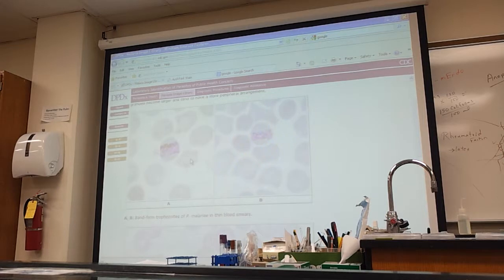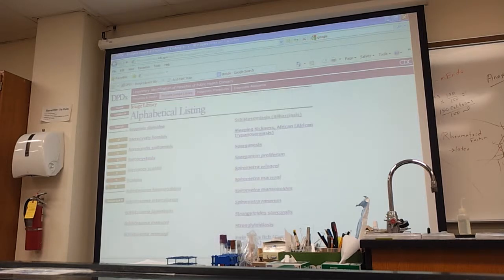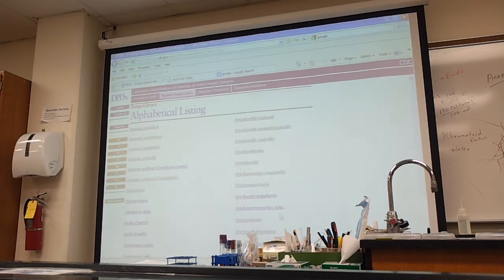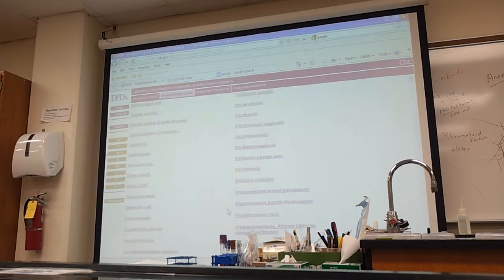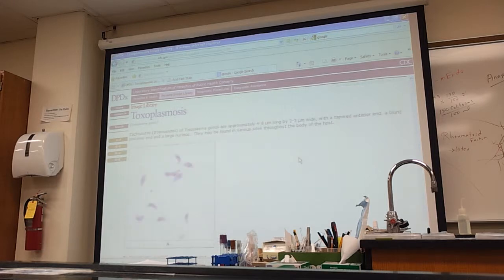So we were lucky one time, we actually saw a cyst that was breaking open. But the trophozoite, or the identifying form that's feeding, these little canoes, little bananas, or some people call them comets. Some people say they look like comets. Always hunting for the best metaphor to help. Toxoplasma gondii. You need to know gondii.